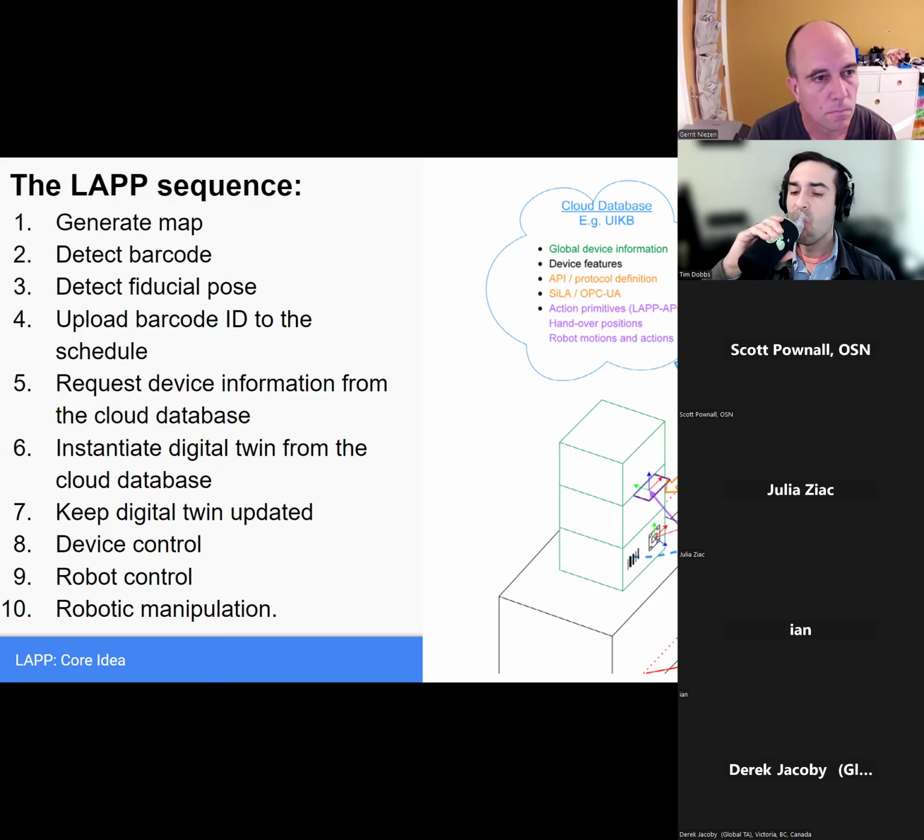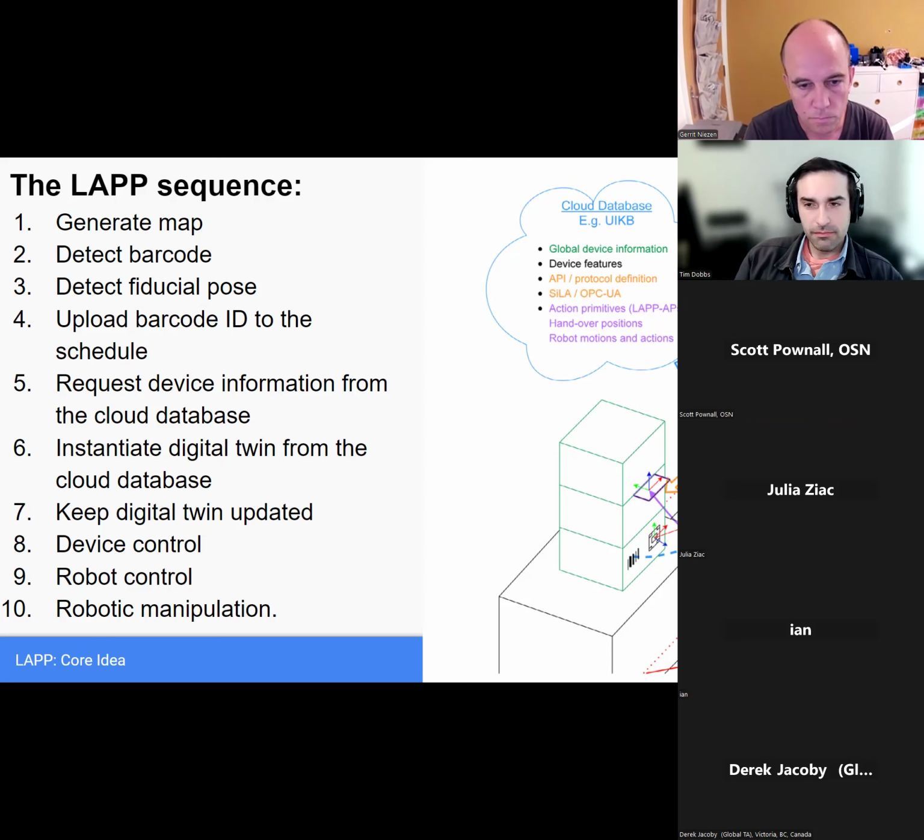I wonder if there's actually a case where you might want to have two robots, and one's just supplying reagents or whatever to the different systems, and the other one's actually moving the pipeline of the experiment through the system. So they'd have to talk to each other as well, at a higher level. Yeah, it's a good point. What they talk about in this paper is they mostly imagine a robot plus humans, but I think the implication is, yeah, you could have many robots.